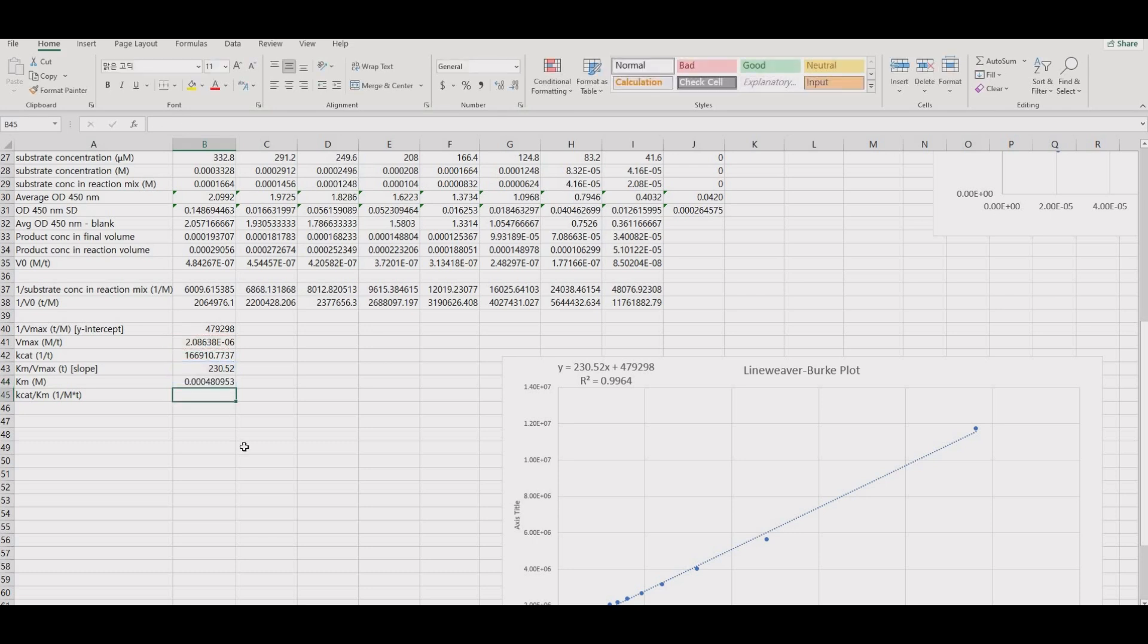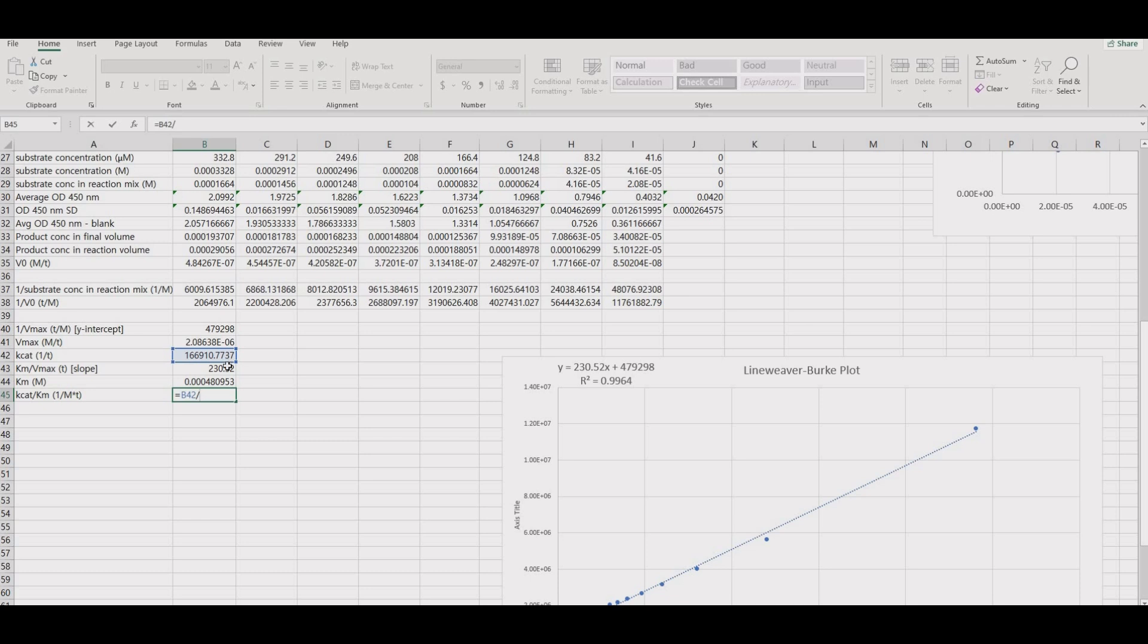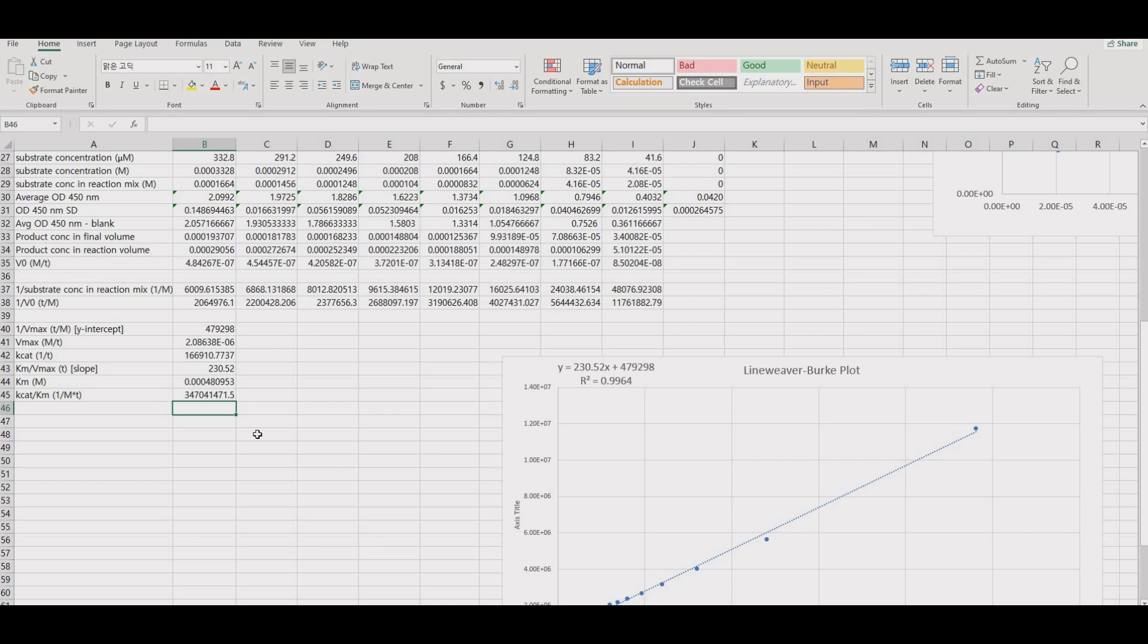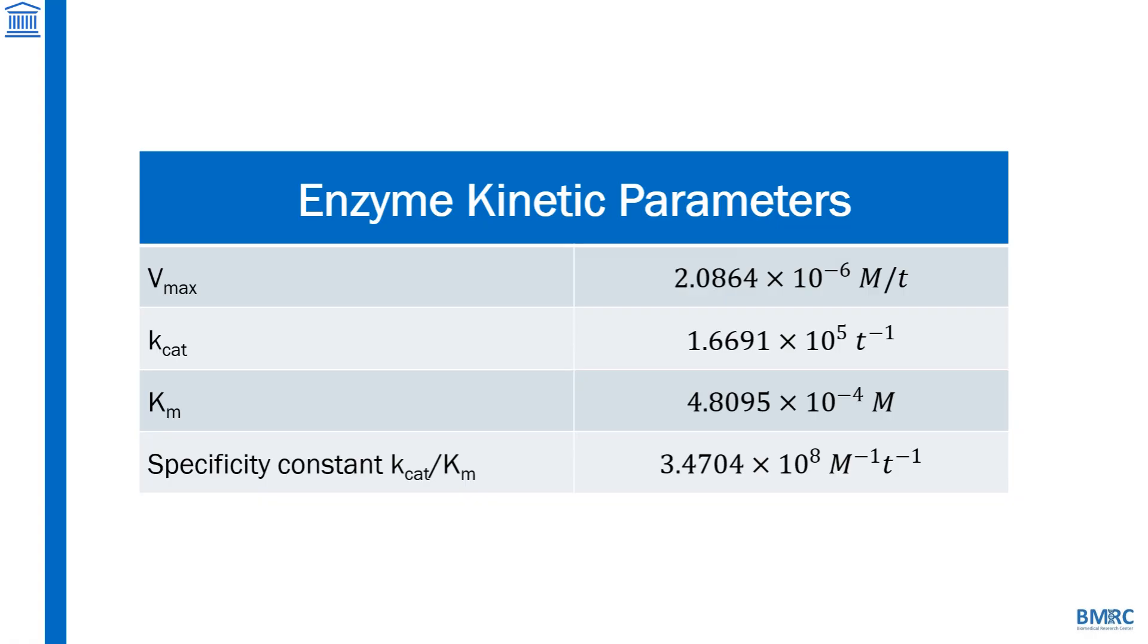The final value to get is the specificity constant, which is the Kcat over Km. The specificity constant is a one-number summary of the efficiency of an enzyme. As you can see, it is extremely high, showing just how good this HRP enzyme is. For MBT students, if you take the immunology course next year, then you will see why this is important for a technique called ELISA.